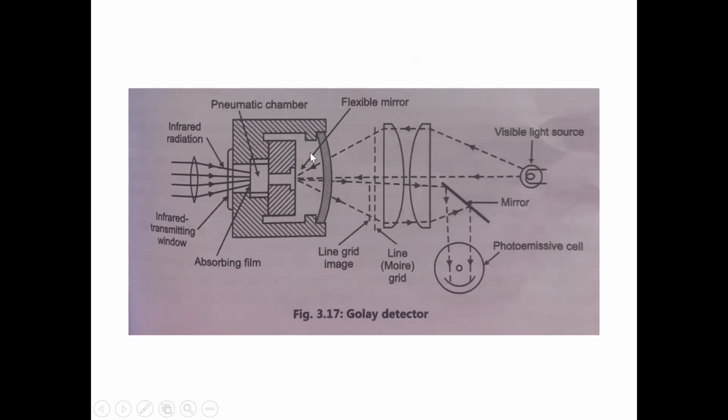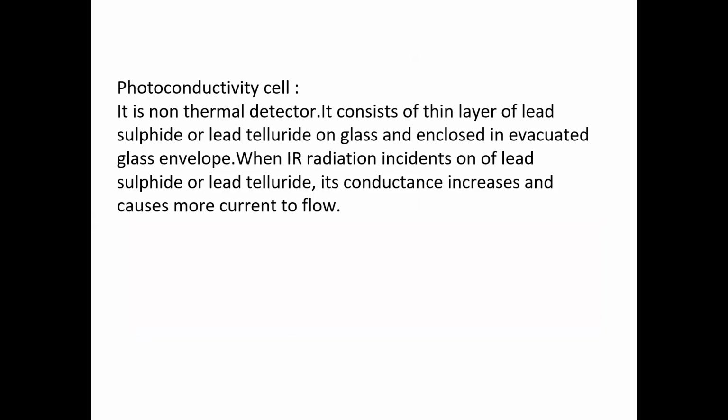But when the mirror is moving, there is change in the intensity of the light due to movement of the mirror. This is Golay cell.